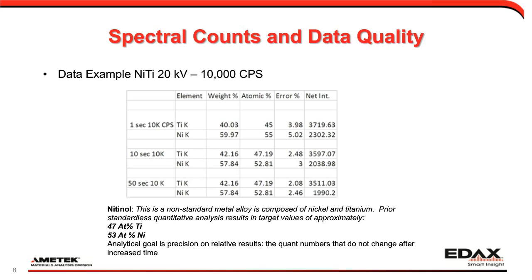That was some excellent insight really into the inner workings of the silicon drift detector and the electronics, the preamp, all important factors in how our detectors work for us to collect our data and to allow us to do our jobs. It's really nice, as the technology is improving and increasing so rapidly, to stay on top of the relationship between all of the factors that go into the electronics. And especially to hear them from an expert such as yourself, it really gives us a good, keen idea about how it all pays off in terms of data quality.